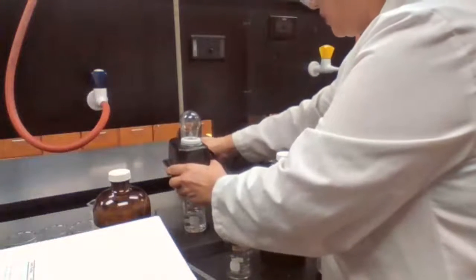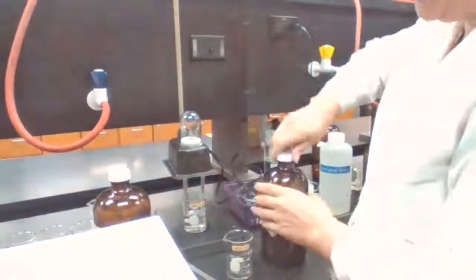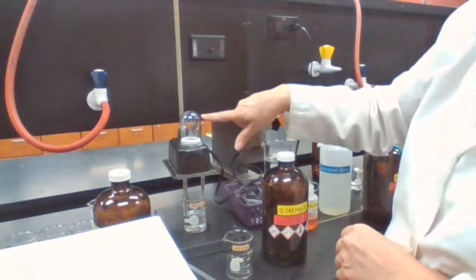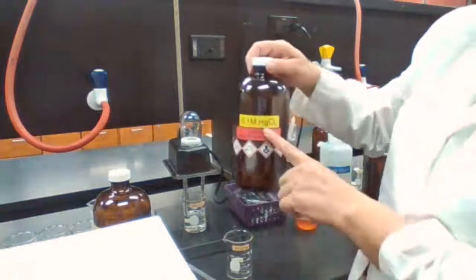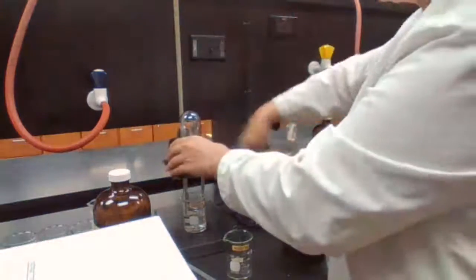So mercury 2 chloride doesn't generate ions, even if it's added to the water. Because it doesn't generate ions, it's going to be non-electrolyte. This was the mercury 2 chloride. So not electrolyte.